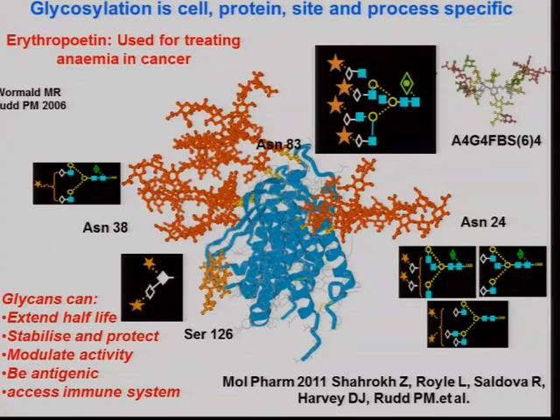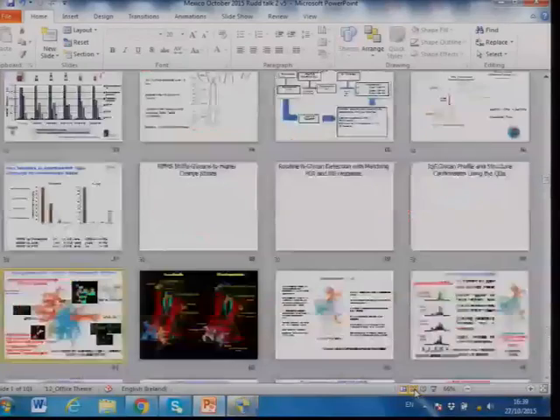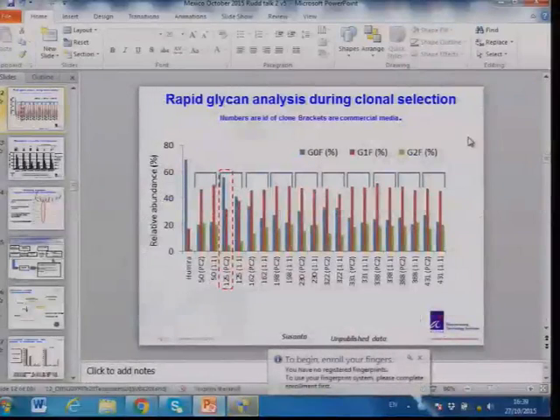Well, do you remember the slide I showed you on clones? They're all clones from the same CHO parent cell, but they are very different. They're under different culture conditions, and just the way the cells are picked, some of them are just different. So these are different clones, right? You can see the glycosylation is different.